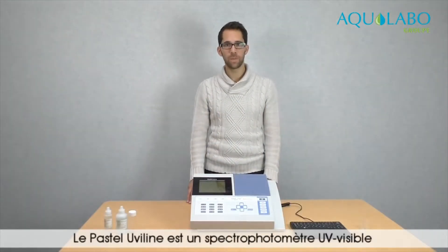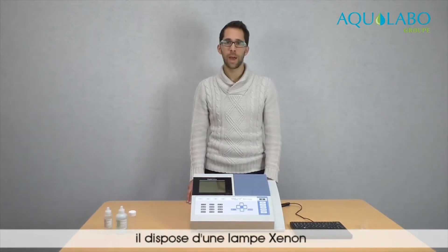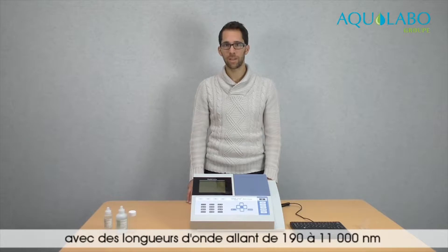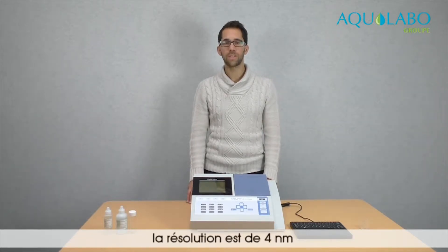The Pastel Uviline is a UV visible spectrophotometer. It has a xenon lamp. The wavelength goes from 190 to 1100 nanometers, and the resolution is 4 nanometers.